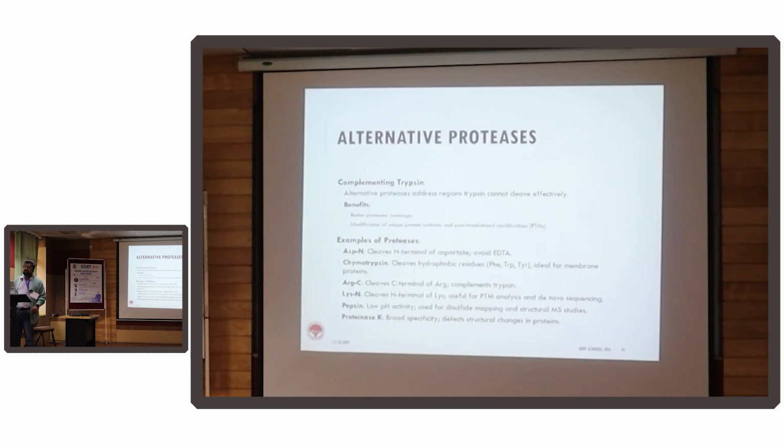But you see, if you go anything beyond trypsin, costs will be one big factor. And as I said, since you will be using this for the next 3-4 years, when you're a PhD, or even if you're doing it for one experiment, your lab would be preferring only one method. People usually stick to trypsin. If trypsin fails miserably, they go for alternative proteases. But we do have alternative proteases.